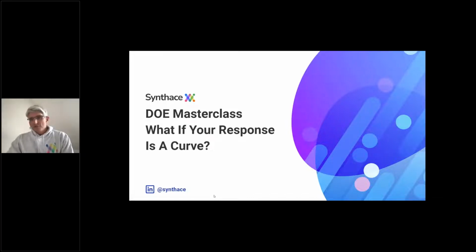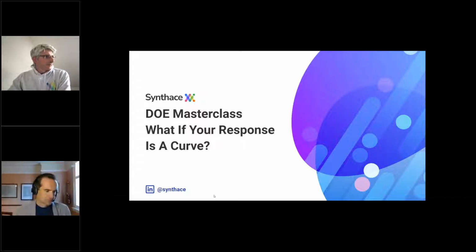It gives me a lot of pleasure to introduce this topic. What if your response is a curve? I think this applies to a lot of biological systems. Certainly, we have encountered it many times at Synthace, where you're looking at a growth condition or a binding condition, and ideally, you'd want to be able to put the whole thing into your response, and usually you have to pick some kind of feature of that curve to try and analyze in normal sort of DOE methodologies, or so we thought. Because Phil is here to obviously tell us about how we can do things better, which I'm genuinely very interested in.